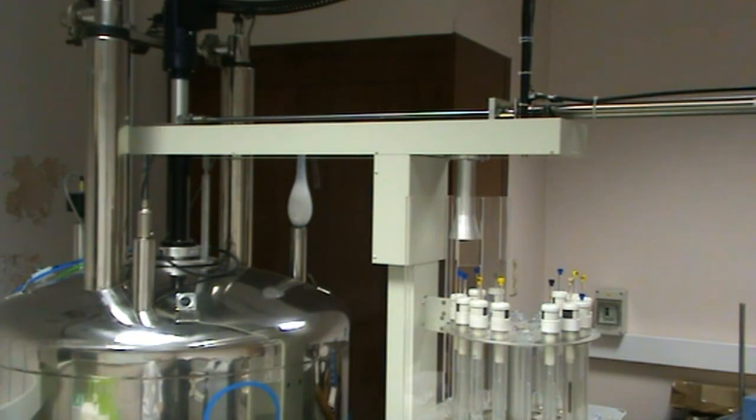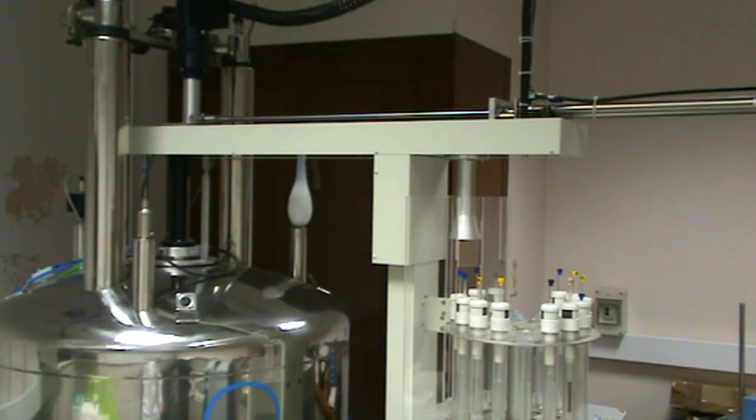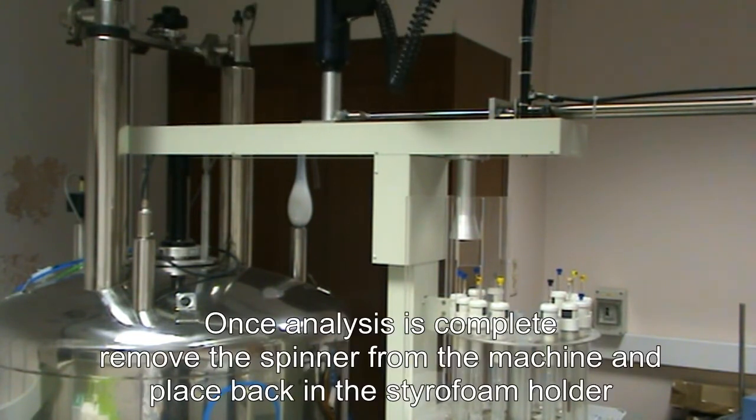Once the experiment is complete, you can remove your NMR tube and holder from the machine. If they have already been removed, please check the beakers with your or your lecturer's corresponding name.